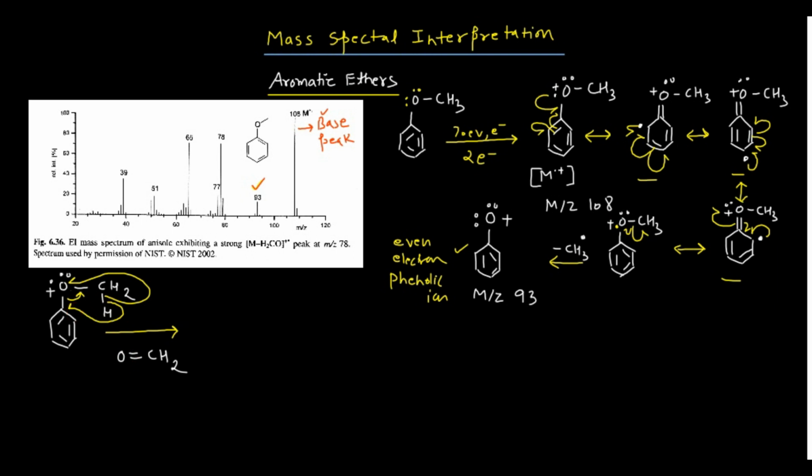And what are you left with then? Please see, this is your benzene ring. Fine. And of course, these are the bonds. And then you are having the hydrogen with odd electron and positive. This is something very, very important you need to understand. This hydrogen has shifted from this methyl group only with 1 odd electron. So obviously this bond which is here is an electron deficient bond.